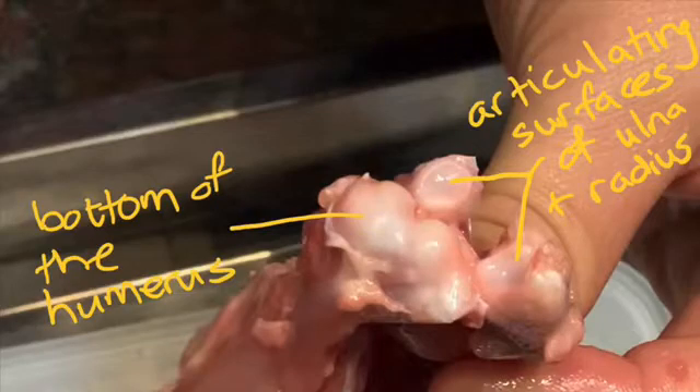You can see that the radius and the ulna are concave in order for the bottom of the humerus, which is convex, to fit into it. This creates a really good hinge joint as they slide over one another. Feel free to play around with this joint and see how it operates as a hinge, sliding backwards and forwards when you do your dissection. The presence of cartilage on the surfaces of these bones makes it super smooth so that there's no friction.